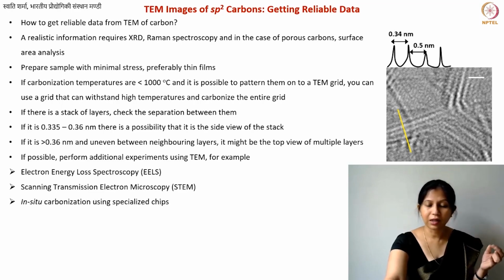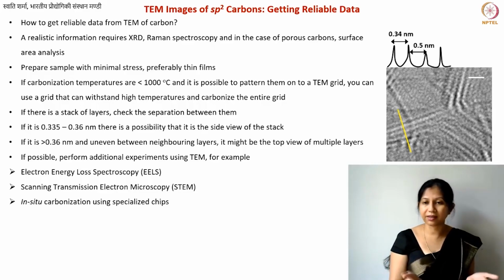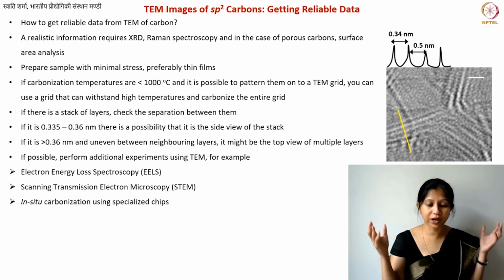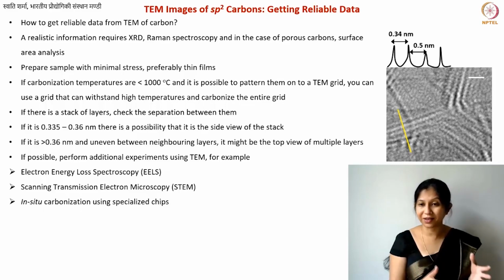Not necessarily all TEM setups are equipped with these additional things, because this machine is already very expensive, and the maintenance of the machine is also very expensive. It also requires continuous high vacuum. It's a very expensive machine, but at the same time you will not always expect that you will have all the features in your TEM.